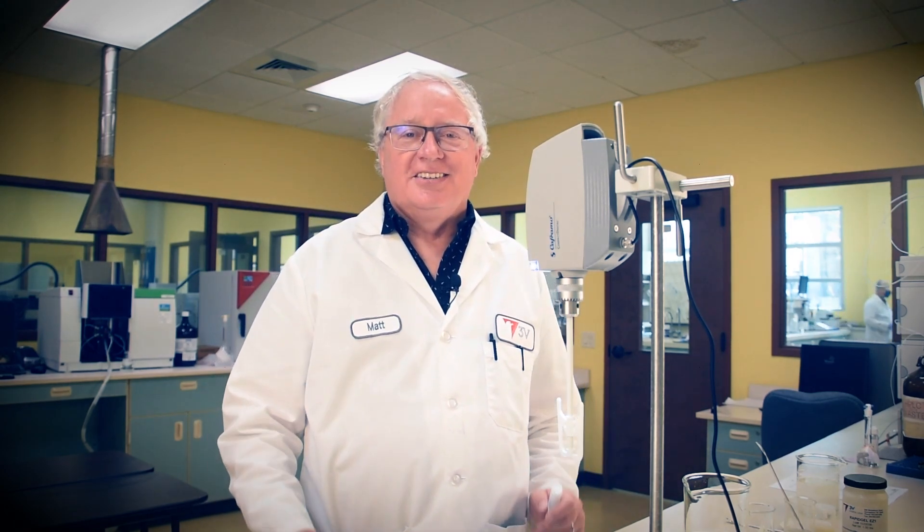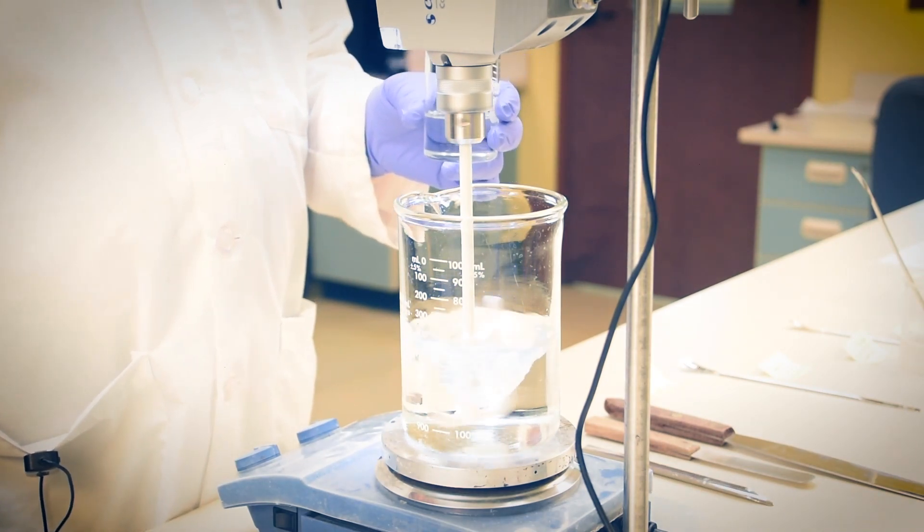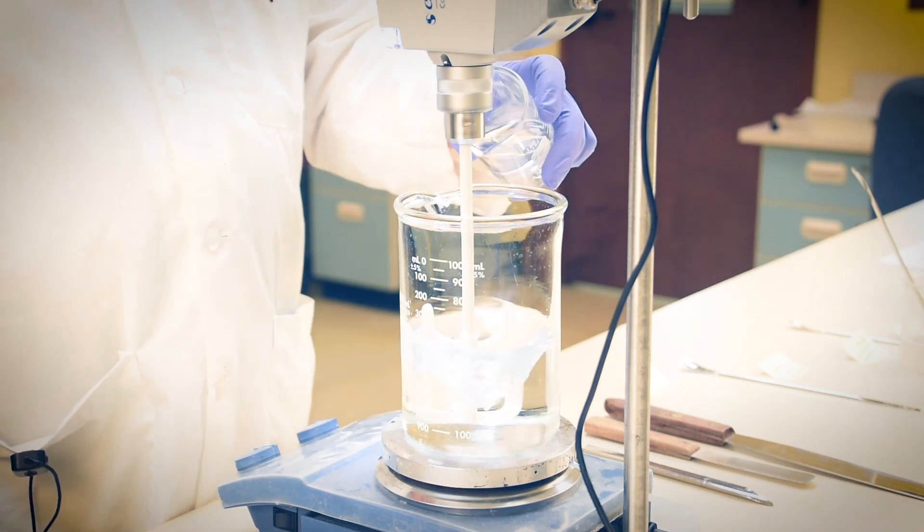Now let's make this thing. To prepare our beta-hydroxy facial serum, first we'll mix together our co-solvent blend of deionized water, glycerin, and butylene glycol.